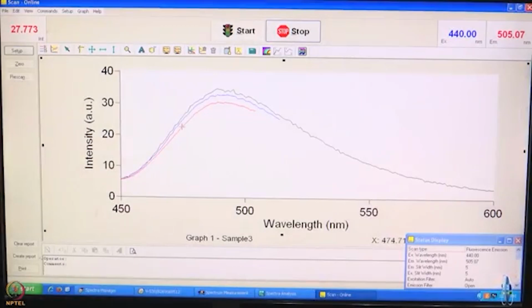All right. So, we have given it several minutes, and this is the spectrum that we have got so far. Now you see, we will not record the entire spectrum, because the point we are trying to make can be made with this data. If you go from the first spectrum to the second spectrum, there is improvement. If you go from the second spectrum to the third spectrum, when we increase the integration time from 1.5 seconds to 5 seconds, there is still some improvement.